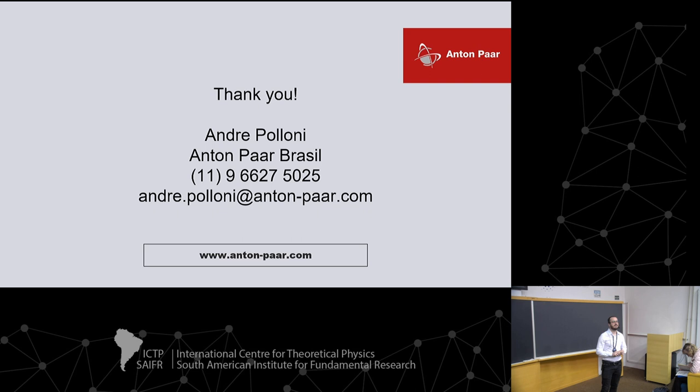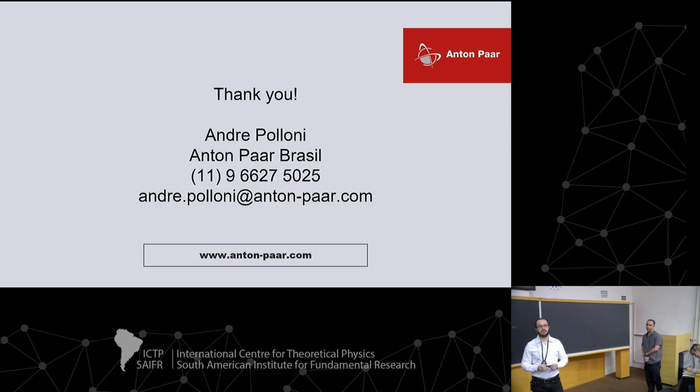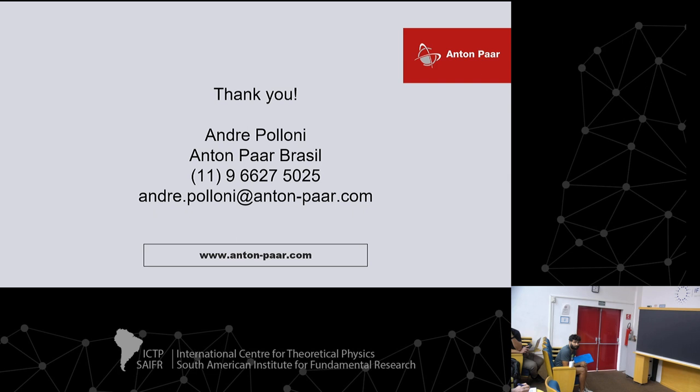It's not too much. Can you measure the surface area of liquids? And does temperature affect the surface area of solids? Well, it depends. Of liquids is not possible. But the temperature affects, but it is more related to your sample than to the technique itself. So, for example, if we correlate with BET, you will have to use different temperatures, cryogenic temperatures, when using argon, nitrogen, krypton, these normal gases used for physisorption. But this is more related to the behavior of your sample at that specific temperature and not too related to the instrument setup.